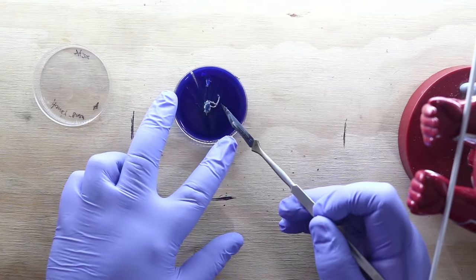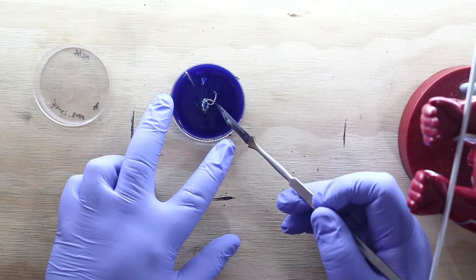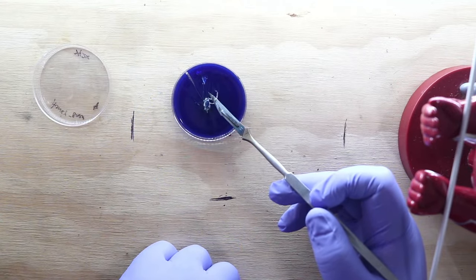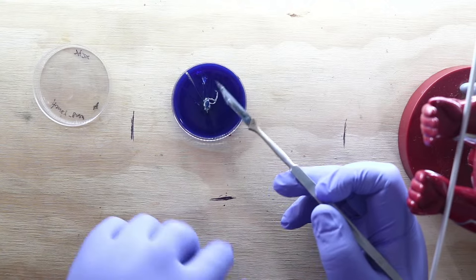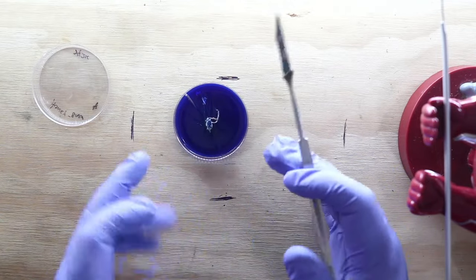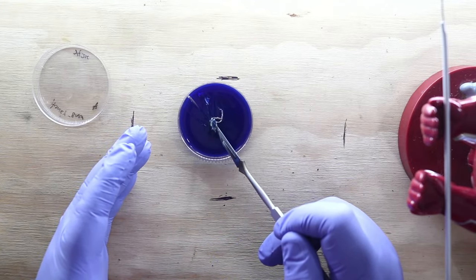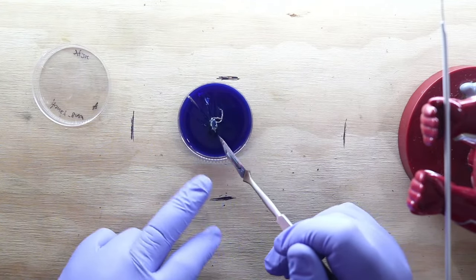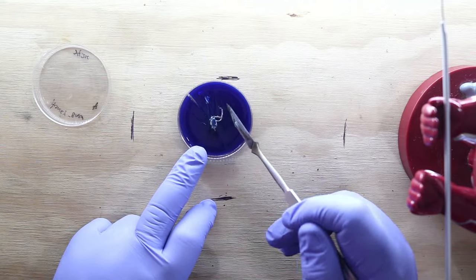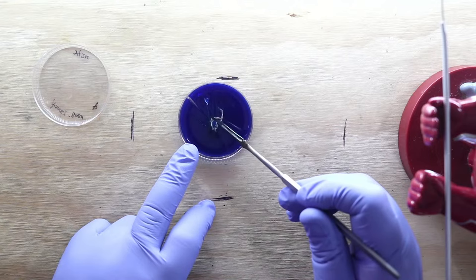I don't know if you guys can see that they're kind of fuzzy. That fuzz is just more mycelium. These rhizomorphs penetrate deep and then fill out a space. Thank you, tentacles. I appreciate it. So this is basically just an agar dish with, you can see, a piece transferred to it. I've got mycelium growing out around here, and I've got the tentacles, or the rhizomorphs, growing out this direction. There are also lots of rhizomorphs that you may not be able to see that are just under the surface.